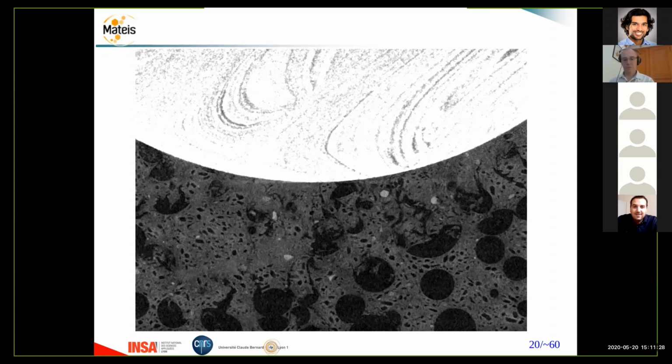Thanks. So there is another question from Jinbo Bai. Is Tomo suitable for in-situ monitoring of deformation? Fast enough to record the data? How long does it take to record an image? Well, it goes from a fraction of a second, very quickly, to the standard answer to this question, which is something like 5 minutes. Normally, a good quality image takes you 5 minutes on a standard procedure to acquire.